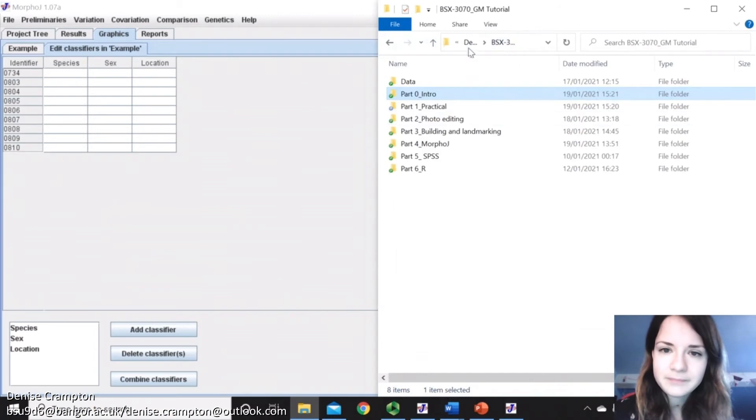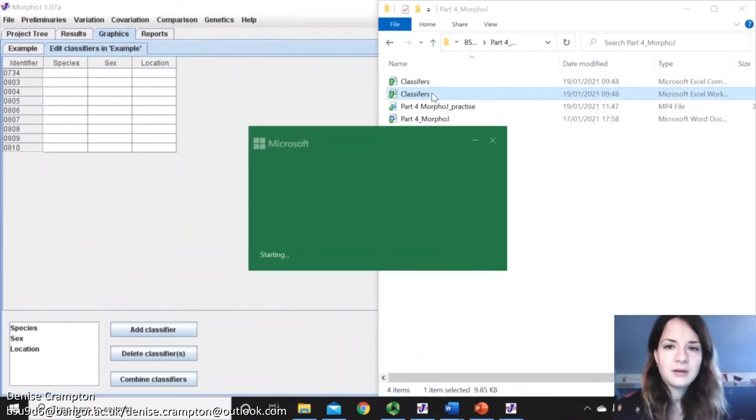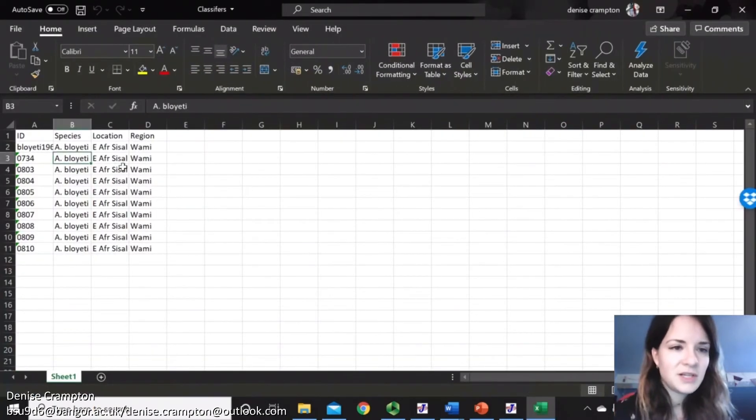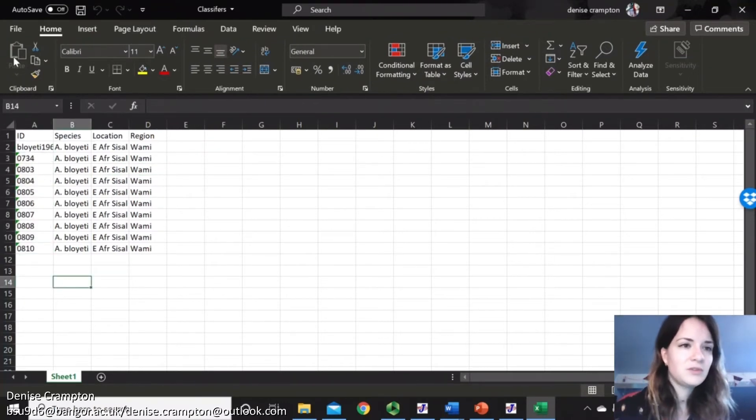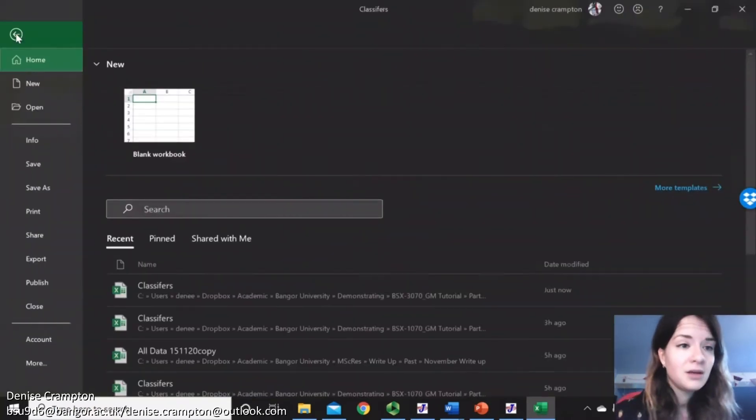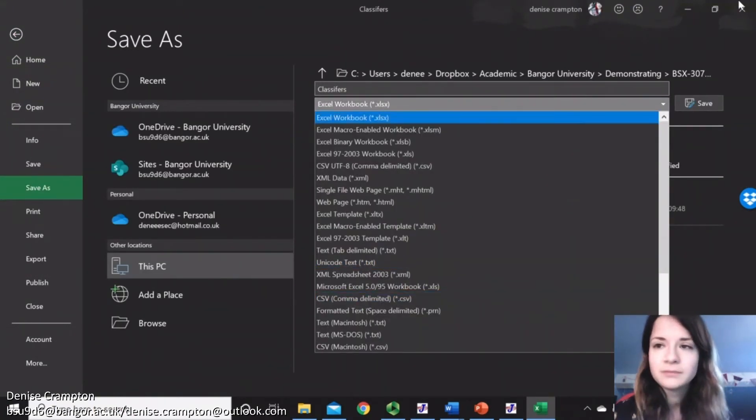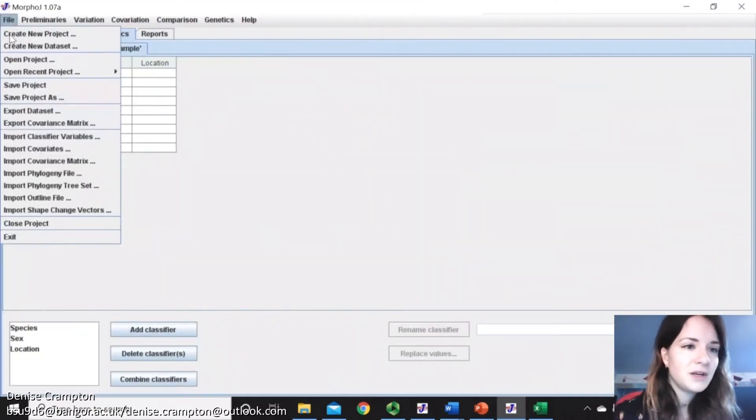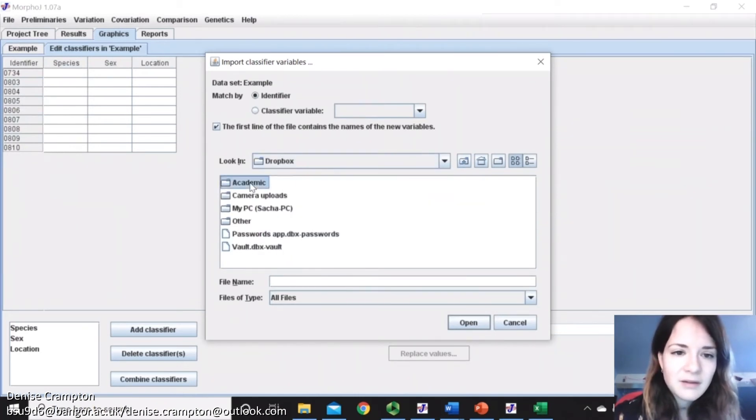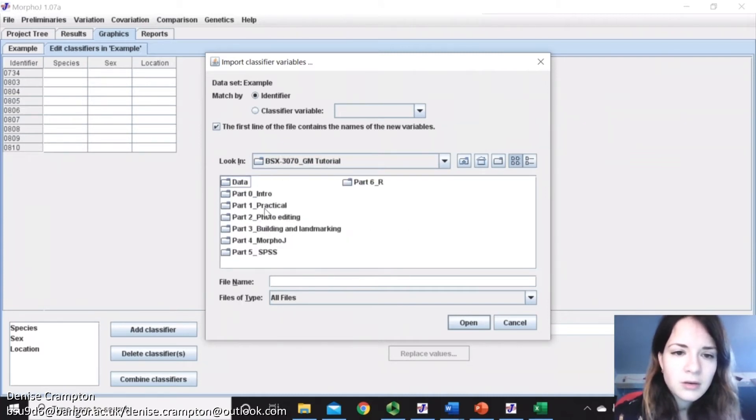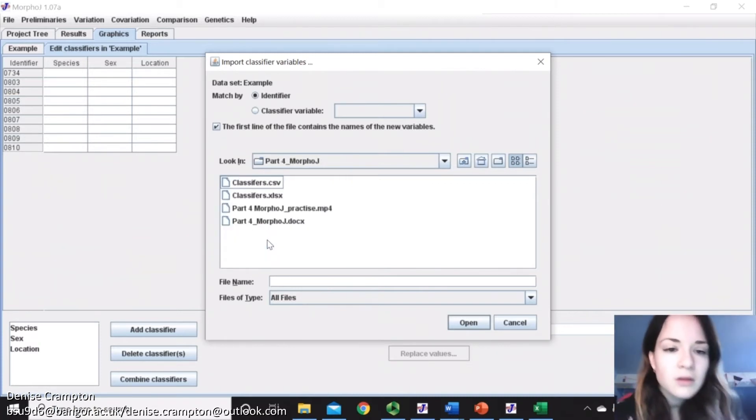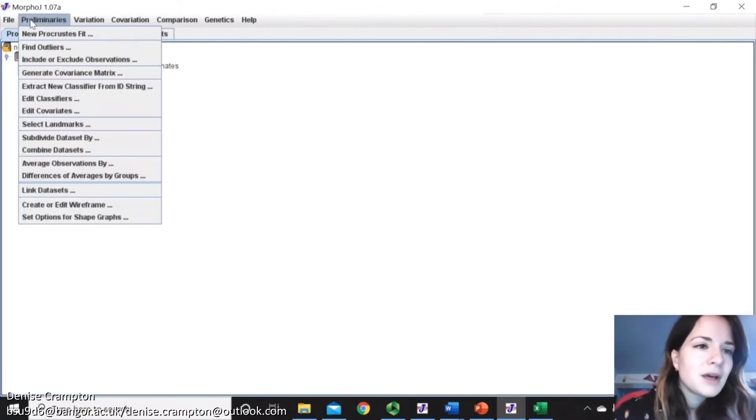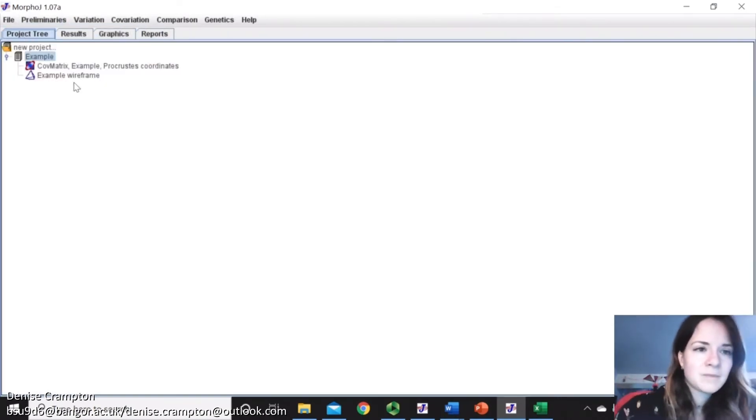So I did that, which is here. And you can see I've just done species, location and region. And then you just do that in Excel, making sure the ID is the same as the ones that you've used during your landmarking. And then you do File, Save As, and then comma delimited file. And then you'll end up with that one there. And then what you can do is File, Import Classifier Variables, and then find that classifier file, Open. And then if I go on here and I edit classifiers, you can see that it's now filled them all in. So I don't need to do that manually, which is great.